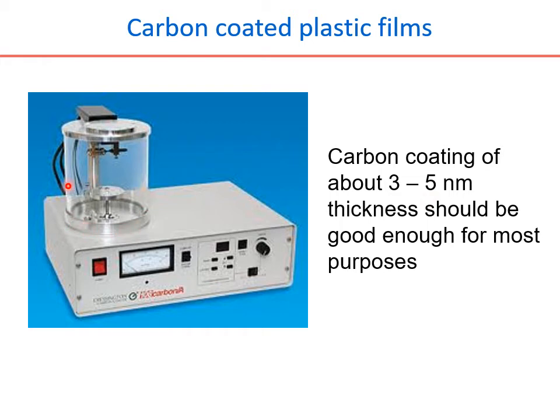So the next question comes, how much confidence can we have between the thickness that is sensed at the sensor and at the copper grid? Let us say the sensor is placed somewhere here, I am just giving an example, and you are monitoring the thickness of the carbon coating here, and your copper grids are laid here. So how sure are you that the thickness monitored here will be the same as the thickness deposited here? There may be some difference between these two, and this is one of the disadvantages of going for the thickness monitor. For this we have an alternative.